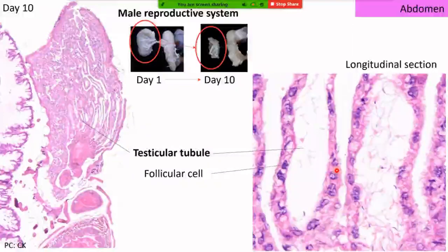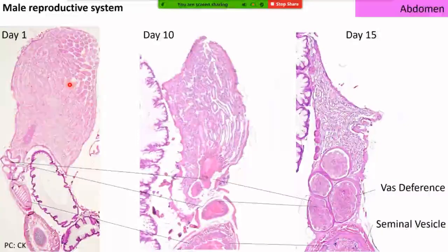For a general conclusion, when you look at drone reproductive histology, it will depend on the age at which you're examining the drones. And again, on day one, the testes will be the greatest and the tubular part of the reproductive tract will be empty. But as the drone matures, the testes will decrease in size and atrophy greatly, while all of the sperm will move on from the testes into the vas deferens first, and then be stored in the seminal vesicle until the drone is copulating, at which time the sperm will be expelled through the endophallus into the queen, into her spermatheca, which we'll talk about later.